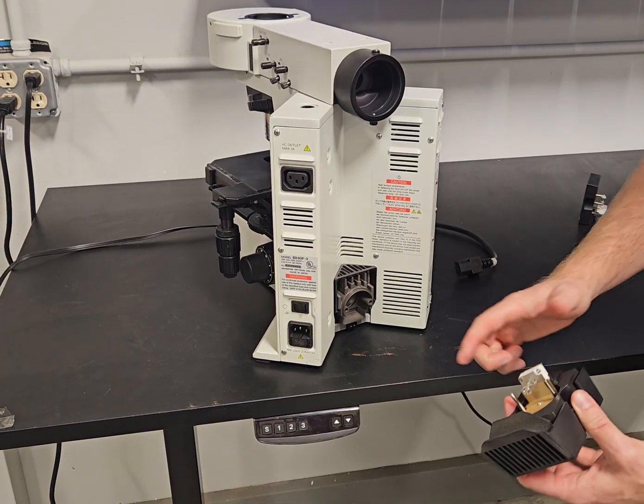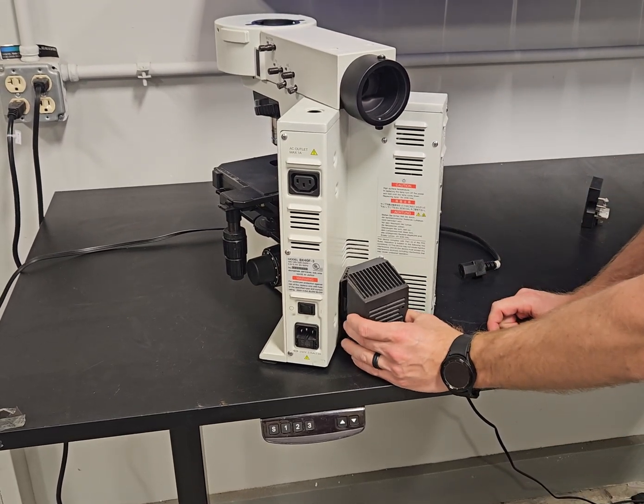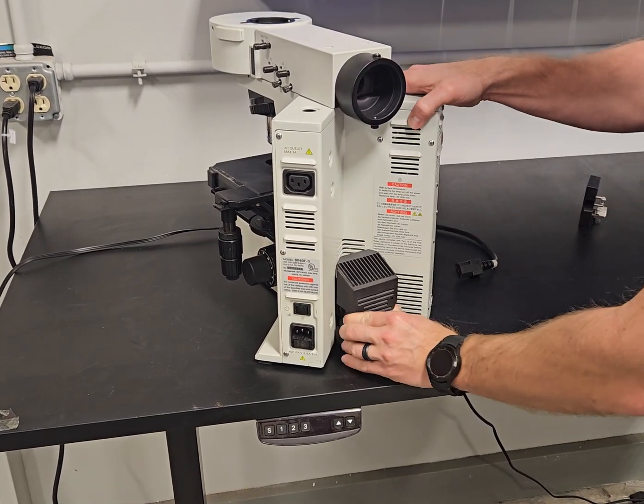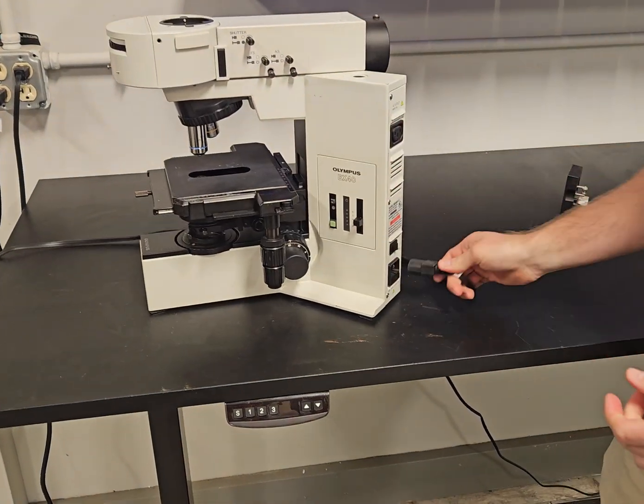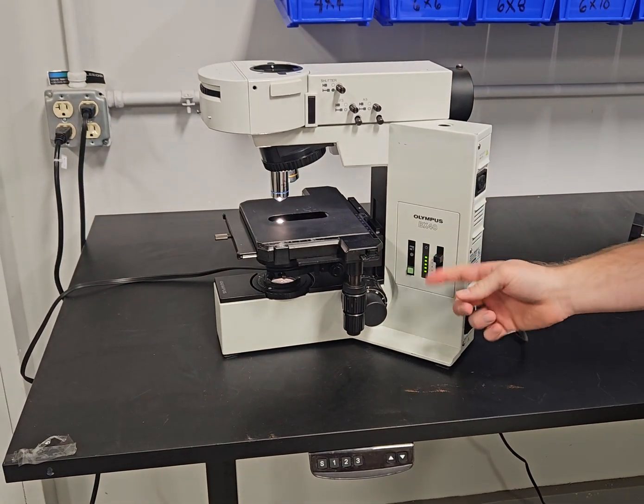It has these pin guideways right here — you cannot screw this up. They go right there in the holes. Press it in, pick the microscope up, plug it in, and now we have light.